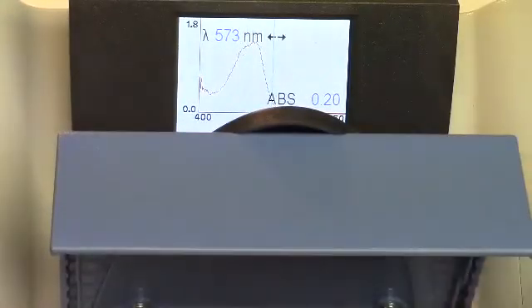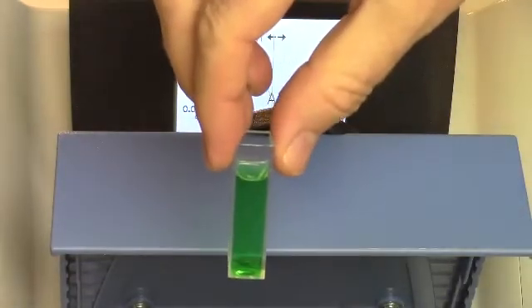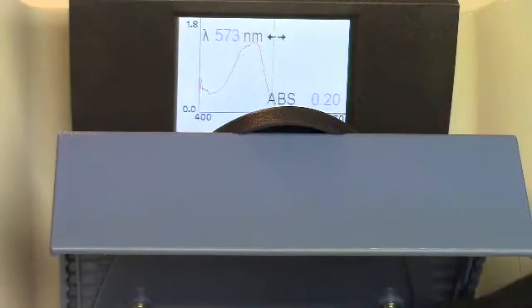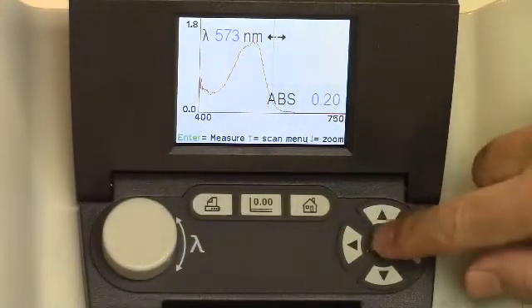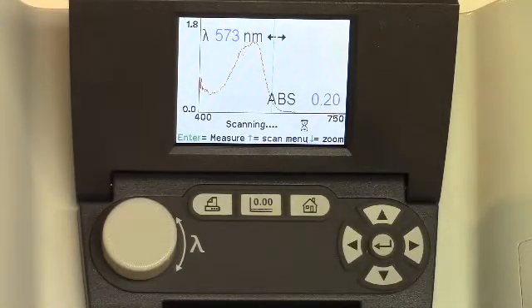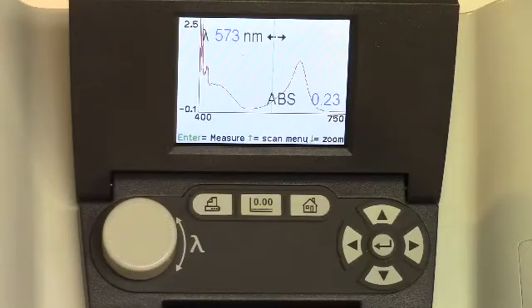Let's go ahead and put in the green sample next. So here's the green sample. You can see that there. So we'll put that in. And let's go ahead and we'll scan that one. You can see how different this spectrum looks from the red one. So there's our green.